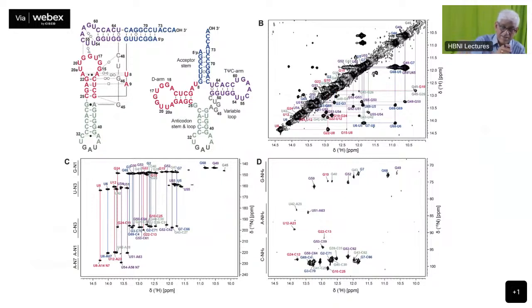So in the base pair, you see a cross peak; one has to remember the base pair structures, okay? So if there are two hydrogen bonds, the imino proton shows correlation to its own nitrogen, and then it also shows a correlation to the nitrogen of the other side. So, N-H-N hydrogen bond, right? Let me write this here.